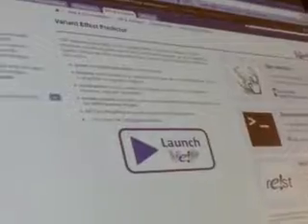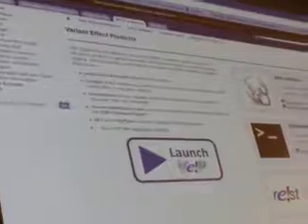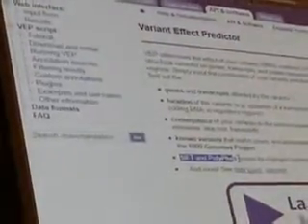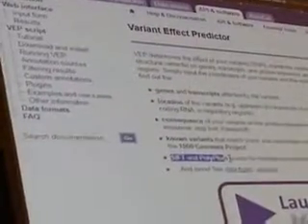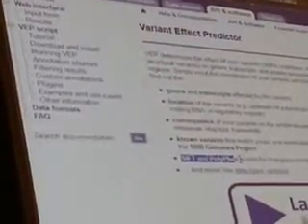So that gives you now gene annotation. Now you know this gene has these particular mutations. So if you're only interested in, like, I'm looking for a stop gain in my favorite gene, do I see it? Then VEP, SnpEff, ANNOVAR, those tools will allow you to determine that. And that's all those tools really do: look at functional impact. How lethal are they? Is this particular mutation benign, or is this particular mutation pathogenic? But I warn you, SIFT and PolyPhen argue with each other all the time. One will say benign, the other one will say pathogenic. And if you look back at how SIFT and PolyPhen were created, you'll understand why.